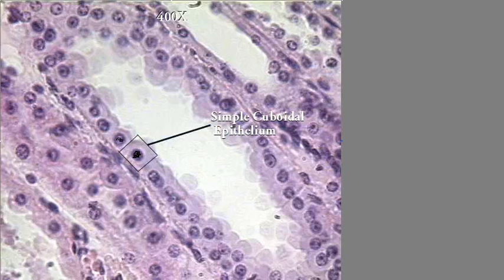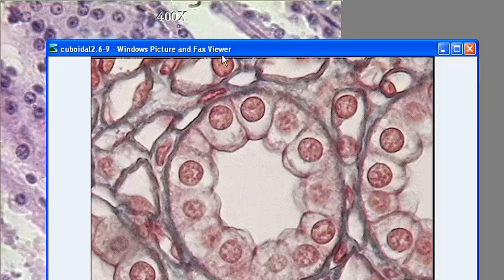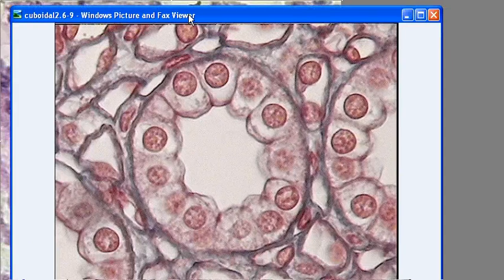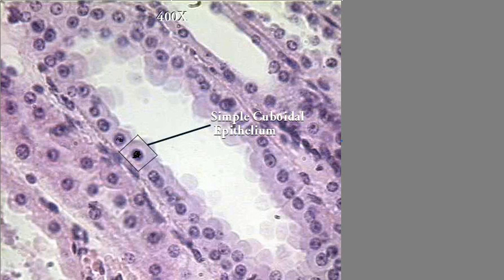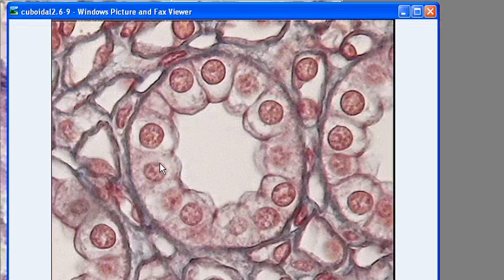Not all structures will look like this when you see them under slides, on tests, or wherever you see them. For example, you might get a circular one like this. Same concept, same basic idea, same function, same structure, same everything. And even the dots right there — those are the nucleuses.